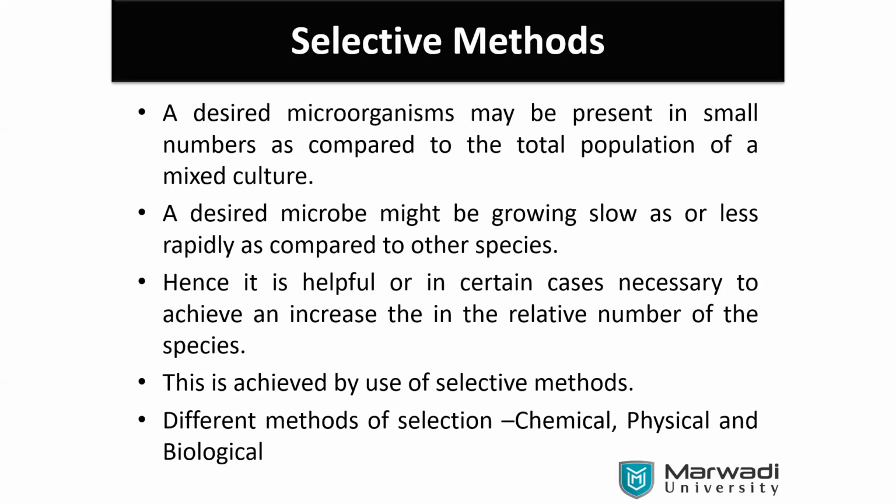So there may be two things. While opening or handling, you may have been talking with each other. Okay, it is routine. Or else, even with the talking, you were not able to open properly. Some people were just helping you out to give the plates and take them out. Time was limited. Lunch time was going on. Within 20 minutes we had to complete. So many factors were there, so there may be a chance that it got contaminated.